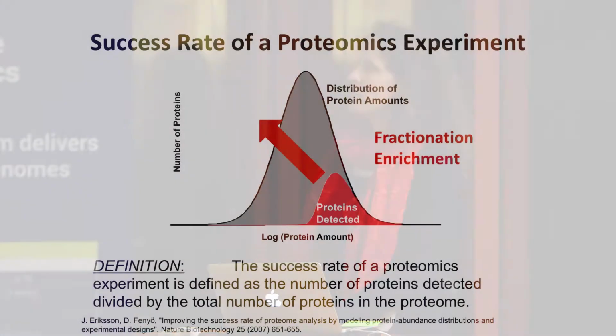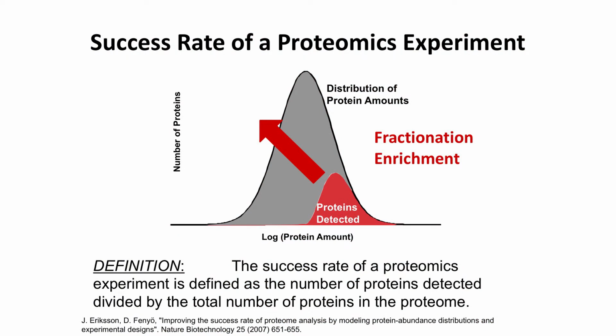And what I would also like to point out, I'm really jealous of the field of genomics, or maybe I'm not, because proteomics is difficult, it's a lot of fun for me to work in it, but when we look at the success rate of a proteomics experiment, if these are all the proteins or proteoforms in your cell, even with the most sophisticated mass spectrometry method, we're probably detecting about this amount of the proteins. The rest goes undetected. That goes back to the abundance bias. So what can one do to increase this range? You can fractionate your sample, which a lot of people do. You just take your proteins, you separate them apart, so you give them in portions, so you get each one a little bit better. Or if you look for specific modifications like phosphorylation, you enrich for phosphorylated peptides.